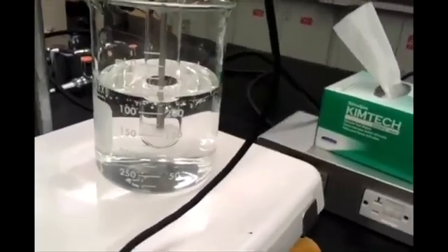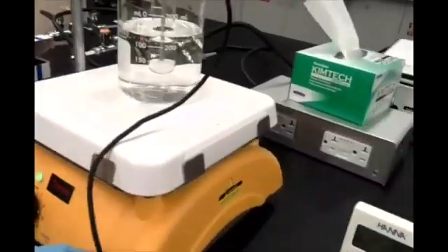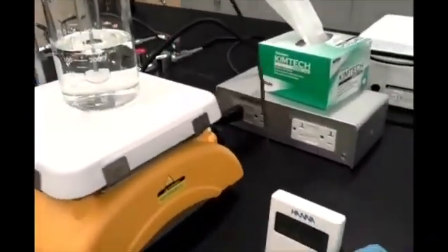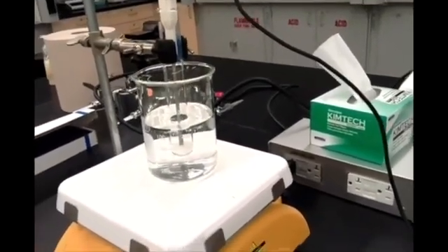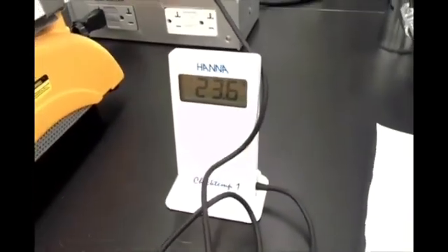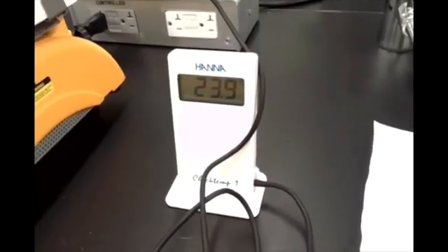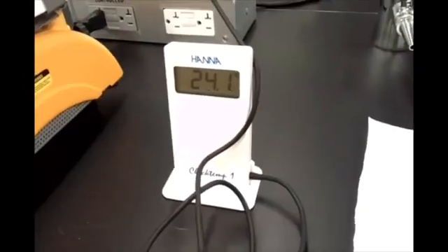We're going to heat it up using this hot water bath and basically convert it into a solution. And once it's dissolved into a solution, we will take it out of the hot water bath. We'll just raise it up on this clamp stand, and we'll make a note of the temperature at which the crystals crash out of solution. Because at that point, where those crystals just fall out of solution, we'll have a saturated solution.